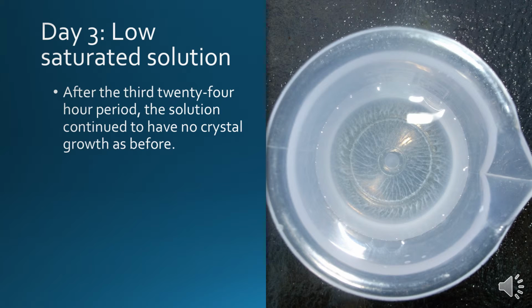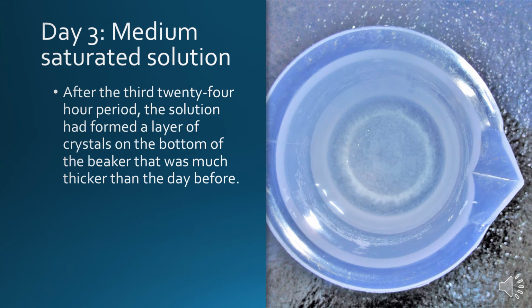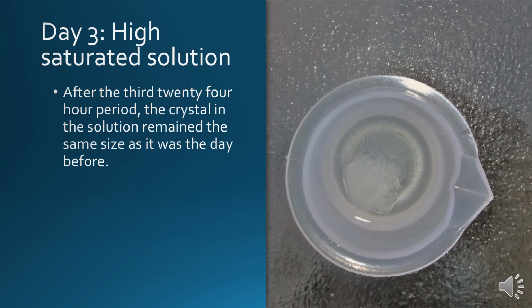Day 3, low saturated solution. After the third 24-hour period, the solution continued to have no crystal growth as before. Day 3, medium saturated solution. After the third 24-hour period, the solution had formed a layer of crystals on the bottom of the beaker that was much thicker than the day before.